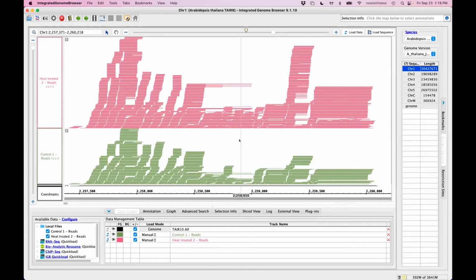really what we need to do is create scaled coverage graphs. These two samples were sequenced to different depths, so we would need to account for that. Now, again, IGB can create coverage graphs, but scaled coverage graphs are a little bit more intensive, because we need to actually pull in that entire file, and we need to analyze that entire file in order to be able to create that scaled coverage graph. So that's something that would be great to run in CyVerse using their computational power. So why don't we jump back to BioViz Connect, and we can create some scaled coverage graphs.